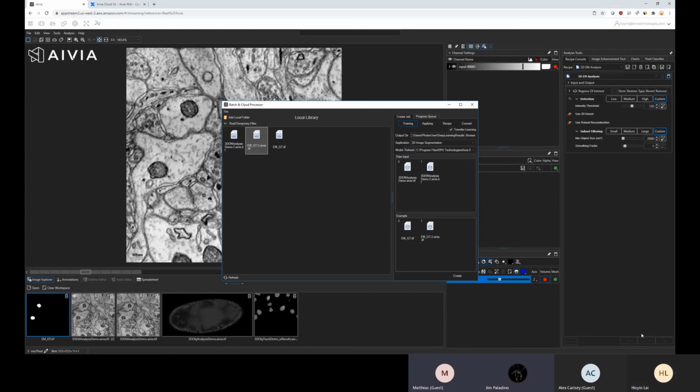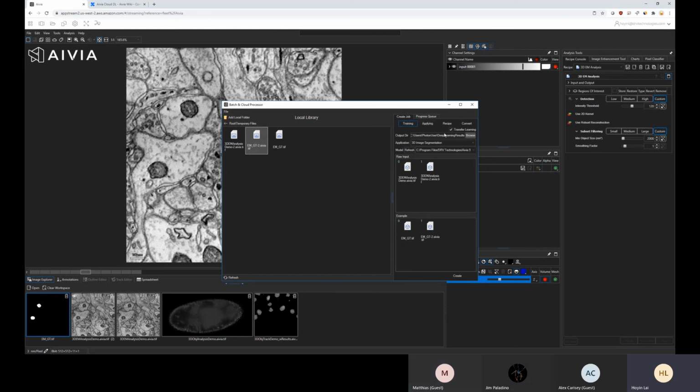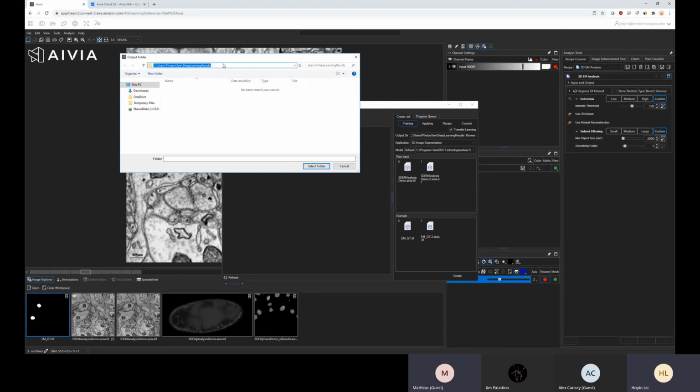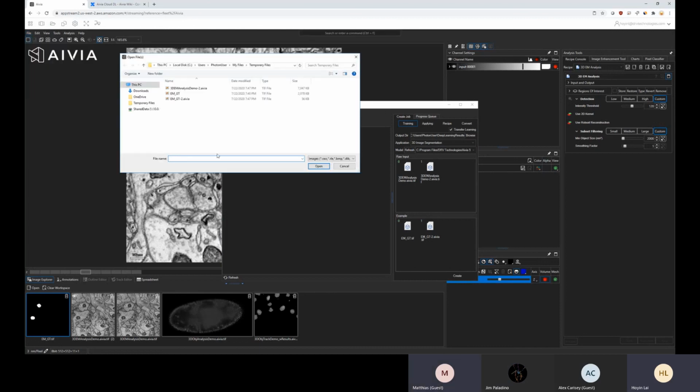This part's actually very easy because it's not very subjective at all. You're just plugging in models and file folders and things like that. But the results could be quite dramatic. So when the model is done, we can go to this folder. Let's say, for example, I go to this folder. I haven't finished one epoch yet.